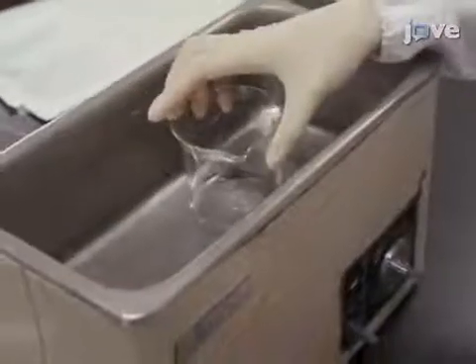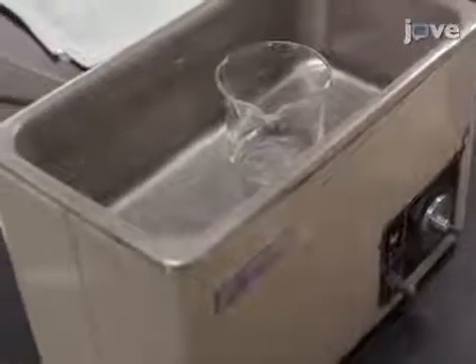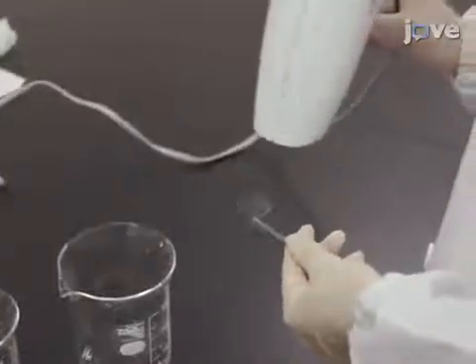Following this, clean the substrate through an ultrasonic treatment in pure water for 1 hour. After rinsing with pure water, dry the substrate with a hair dryer for 2 to 3 minutes until dry.